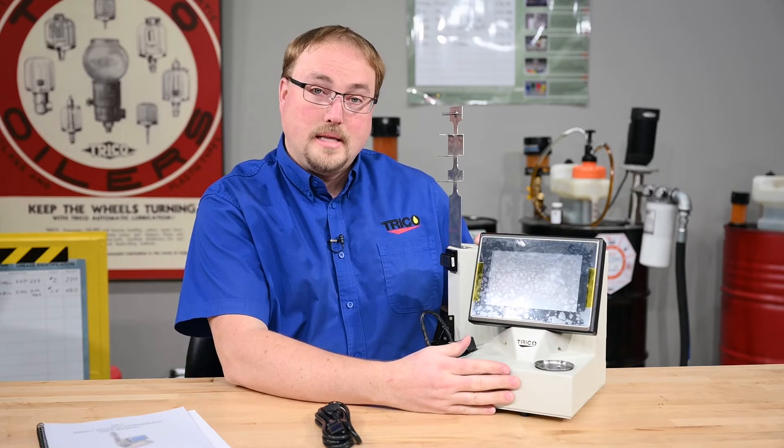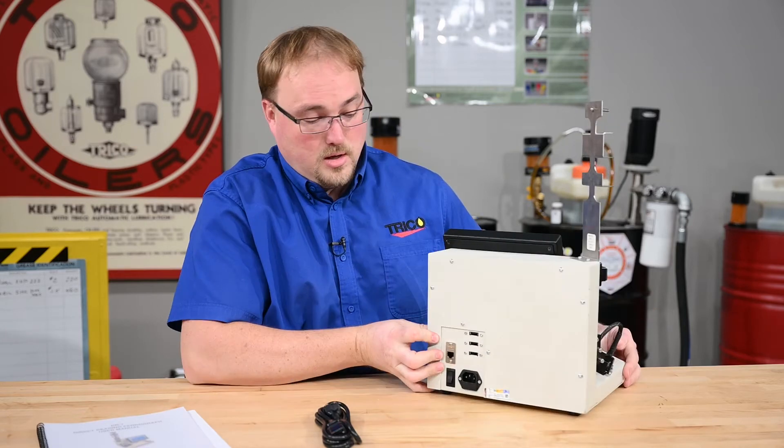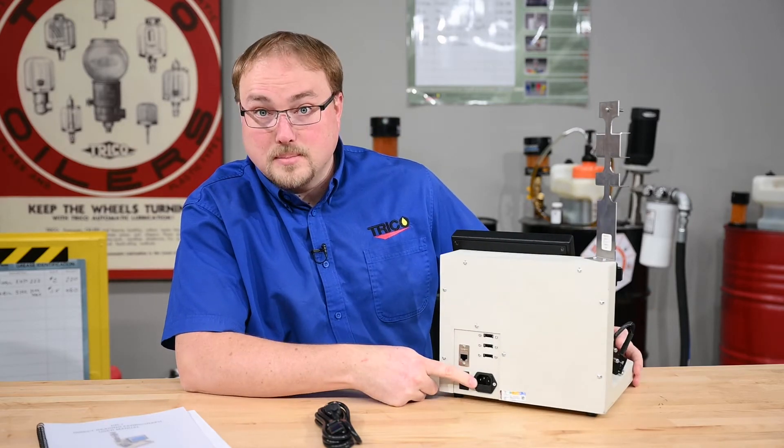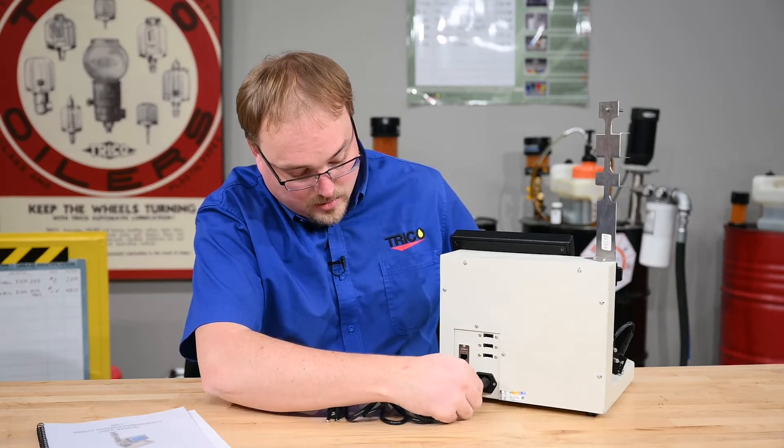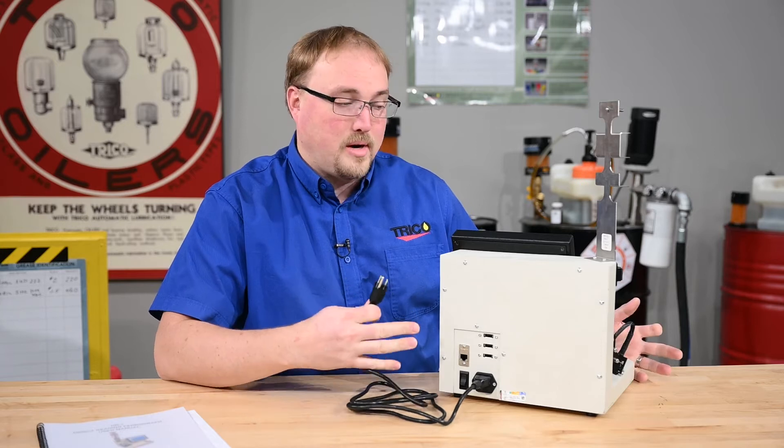Once those are in the unit, the next thing you do is turn around the unit, look at the power receptacle, take the power cord, and attach it into the power receptacle. Then we will plug in the unit to power it up.